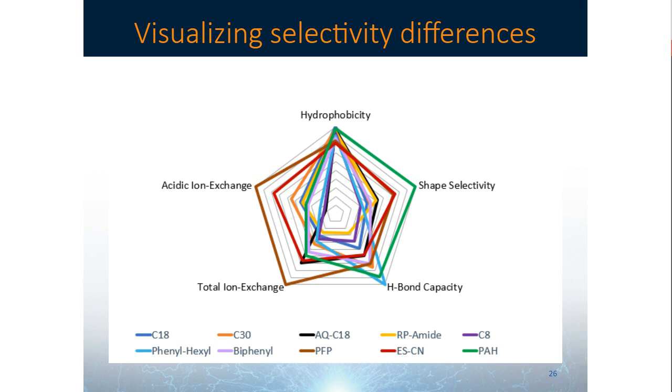If you're just using formic acid at the moment, sometimes you can see different results just because the formic acid will evaporate over time from the mobile phases. So if you're not using mass spec detection, if you're just using UV, then I would recommend using trifluoroacetic acid for some good reproducible results.